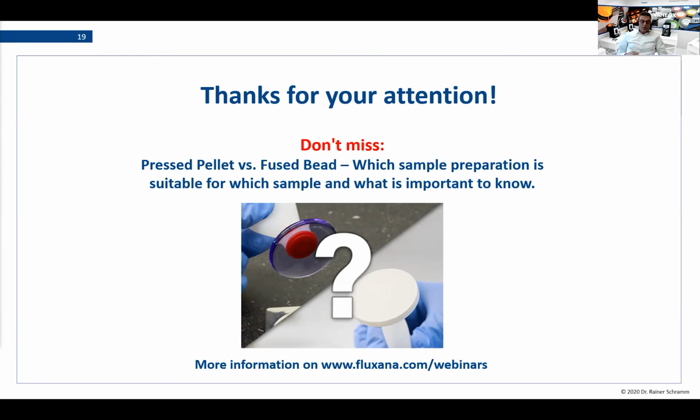So there is another question: how many hours do users typically need to complete the course? I would say you will probably need a full day, because of the time to establish the measuring conditions, to scan all the elements, to check if everything is right, to redo the measurements, then to measure the samples, then to adjust the energy profiles for the detector.